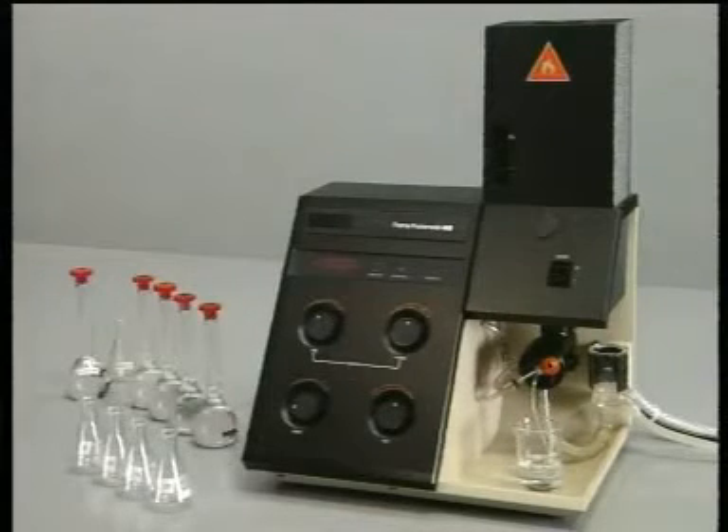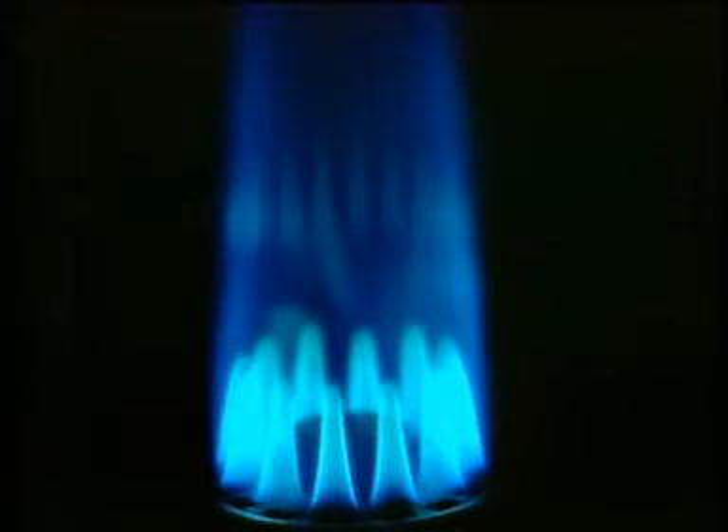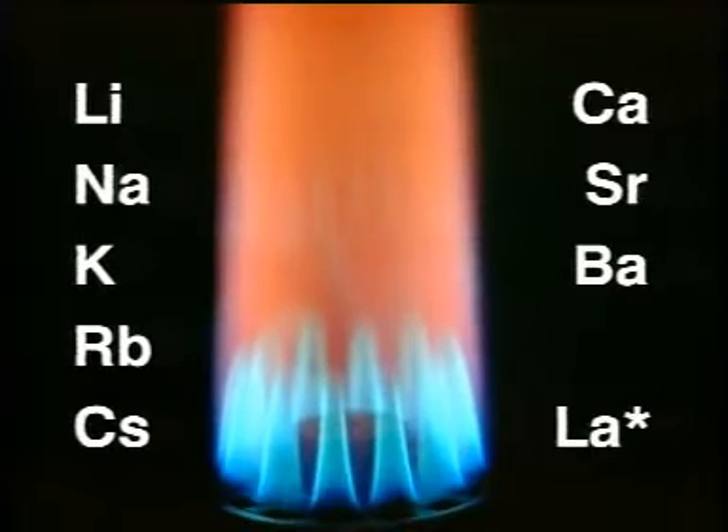Many flame photometers are quite simple instruments and they must always be calibrated against standard solutions. The photometer's relatively cool flame is suitable for the excitation of elements from groups 1, 2, and the lanthanides.